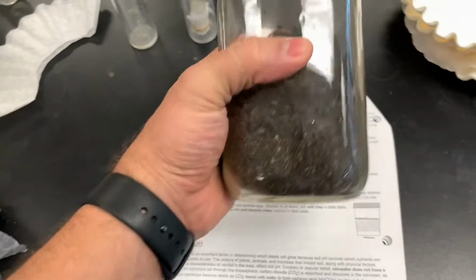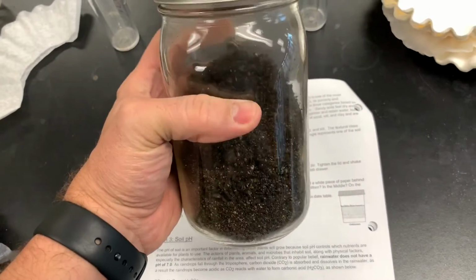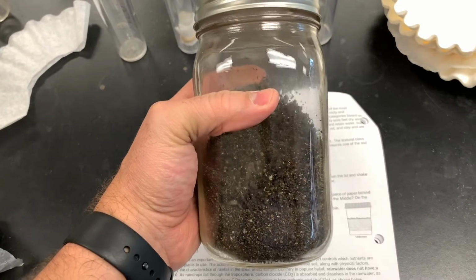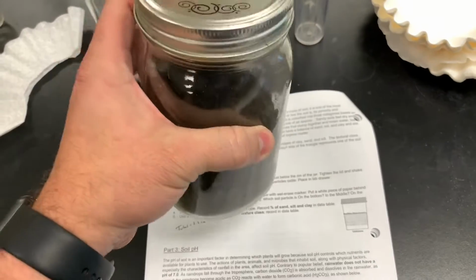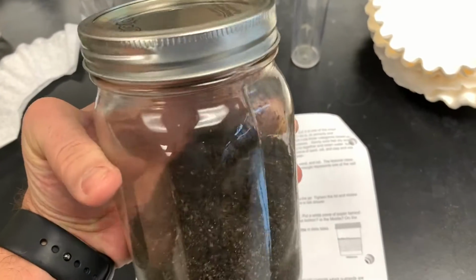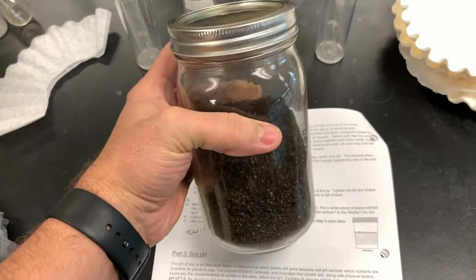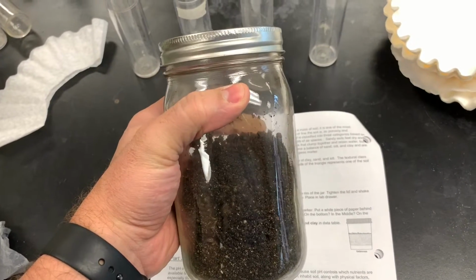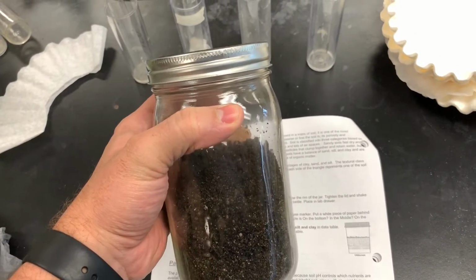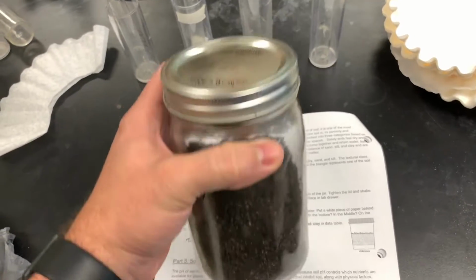So basically you're all going to get a mason jar just like this, and you're going to go out there and you're going to collect your own soil. This is my own soil sample here. And how you do this is you're going to fill it up about halfway, maybe a little bit more than half. That's fine. It's not really an exact amount here. And then you're going to fill it up almost to the top here with water.